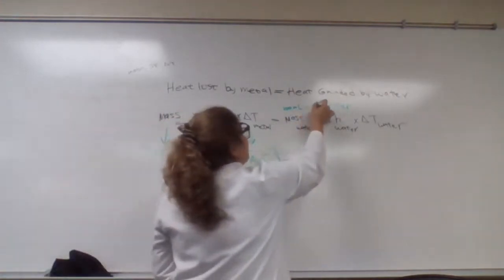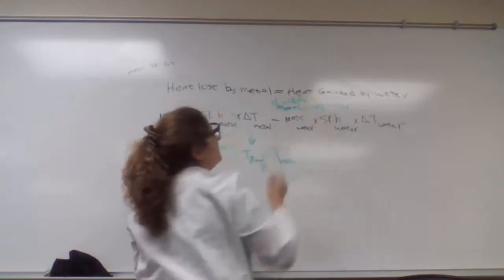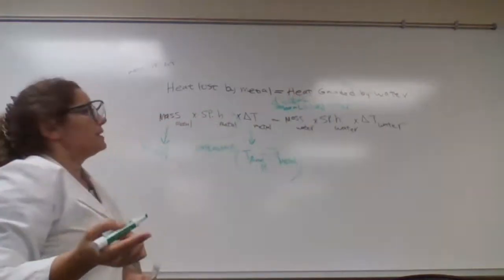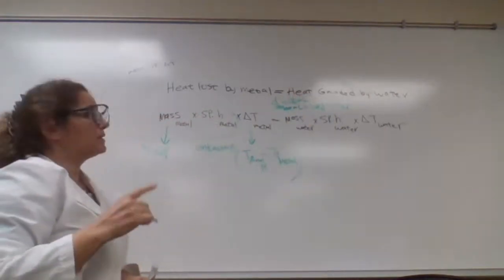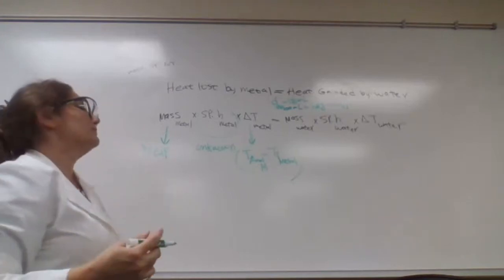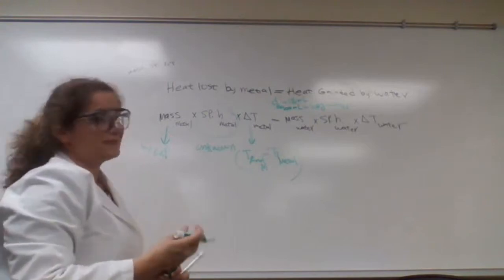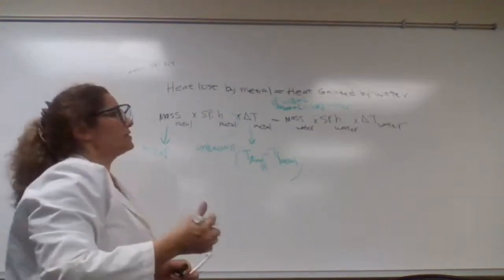Because density for water is 1, density for H2O is 1 gram per milliliter. So every gram is 1 milliliter, or every milliliter is 1 gram. So using 100 milliliters, that would be 100 grams of water. Or you can measure the mass. You can use the density, or you can pour the water and measure the mass.